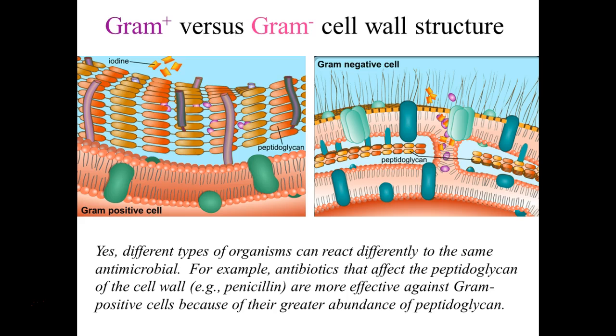Pseudomonas. What do you guys think? Gram-positive or gram-negative, the green plate? It's gram-negative. And it's resistant to a lot of antibiotics. There were only 2 zones you had to measure. I didn't even do the vancomycin on there, but it would have been resistant to that one too. So it didn't even matter that I didn't put that one on there. Just a few of the drugs work on that particular gram-negative. Gram-negatives are pretty scary because of that. We have a lot of resistance.